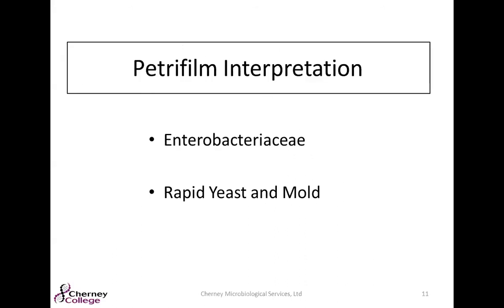So transitioning over into Petrifilm interpretation, I swear I could talk about Petrifilm interpretation all day. Unfortunately, you nor I don't have all day. We just have this webinar. So we've narrowed it down into some of the more difficult interpretations for Petrifilm, being Enterobacteriaceae or EB Petrifilm and rapid yeast and mold Petrifilm.